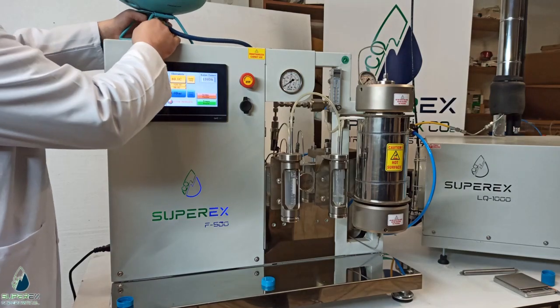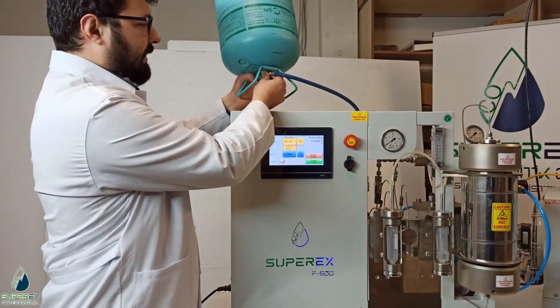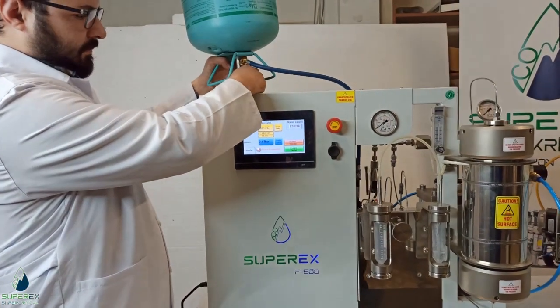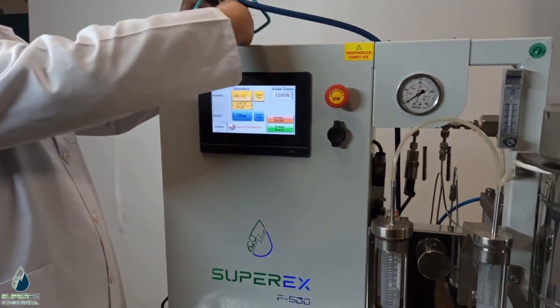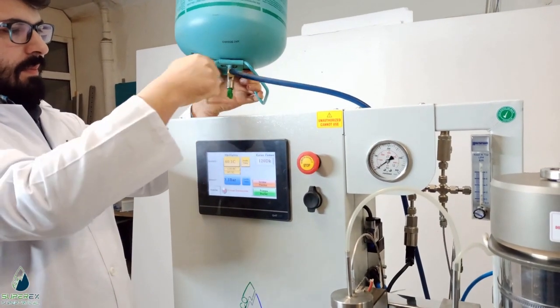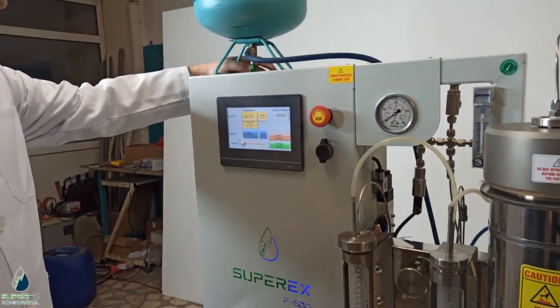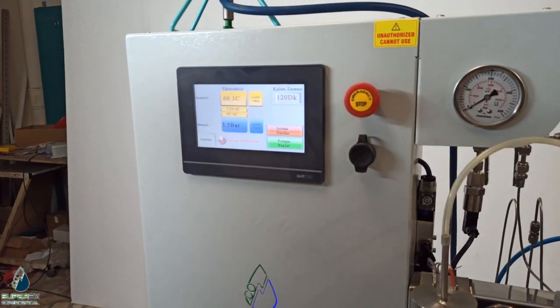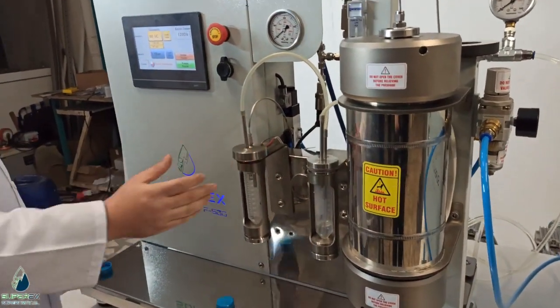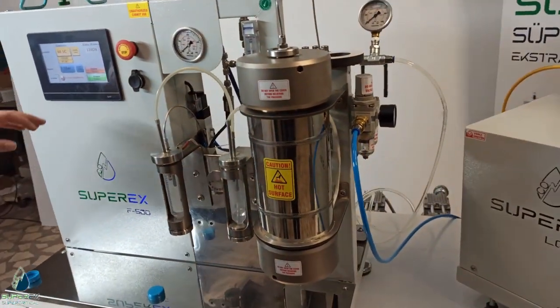It's ready. I will pull the restriction valve — it's closed. Now I open the valve. I am using this tube in this position in order to take the R134a gas in liquid phase. I open it fully. The pressure is at 3.5 bar.